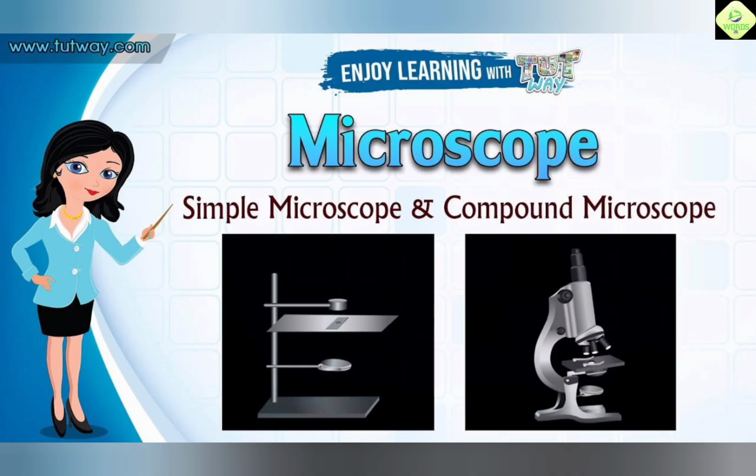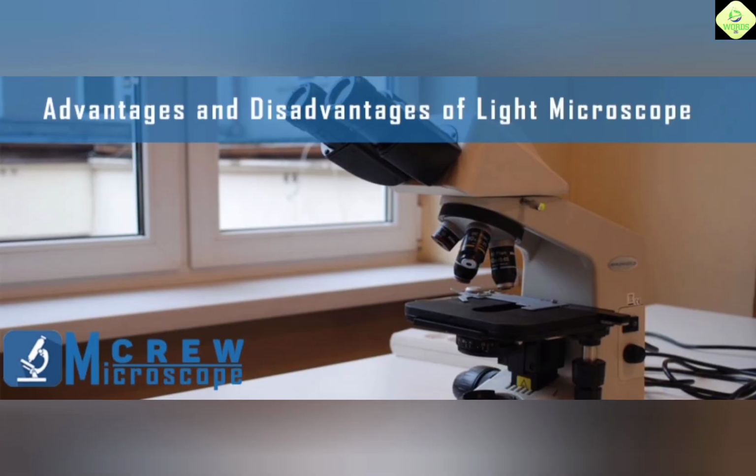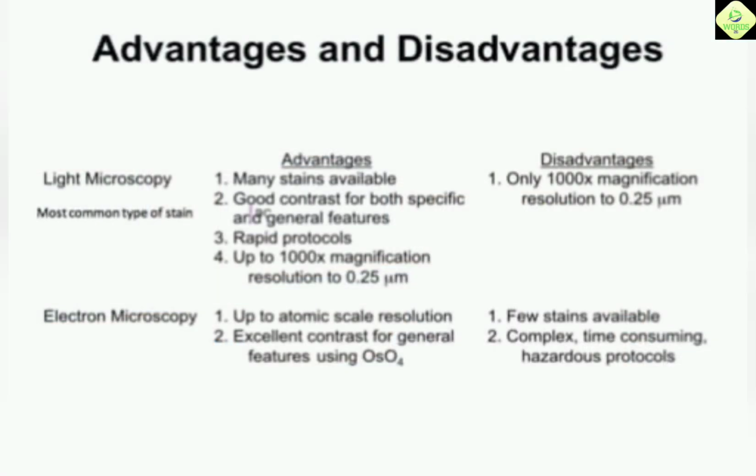Applications of simple microscope. Simple microscopes are applied in biology, studying leaves, flowers, seeds and insects, and observing plant and animal tissues. In medicine, primarily examining skin, hair and nails. In jewelry, inspecting diamonds, gemstones, and gold ornaments. In watch repair, examining tiny gears and springs.